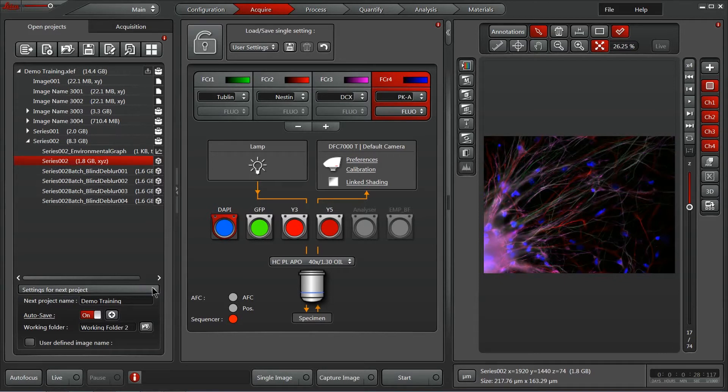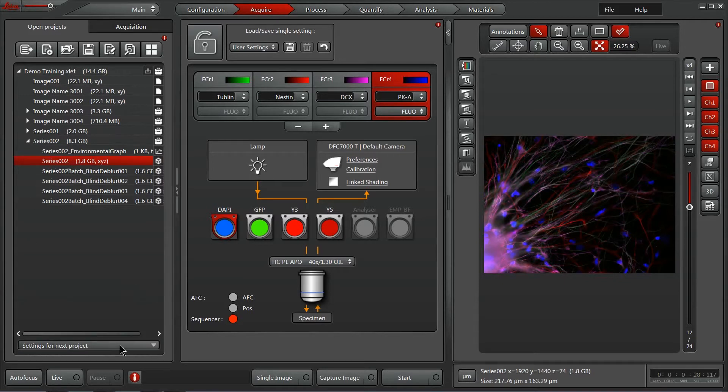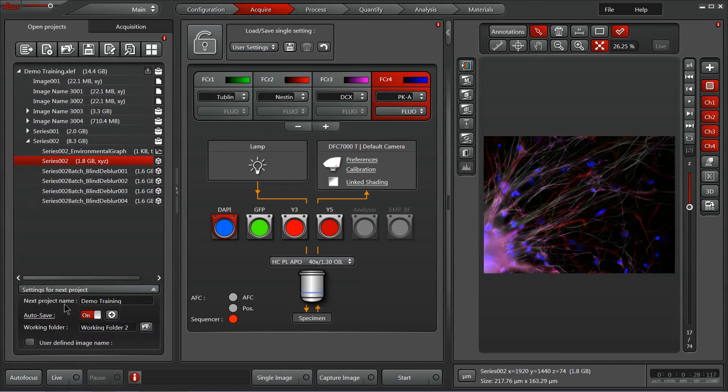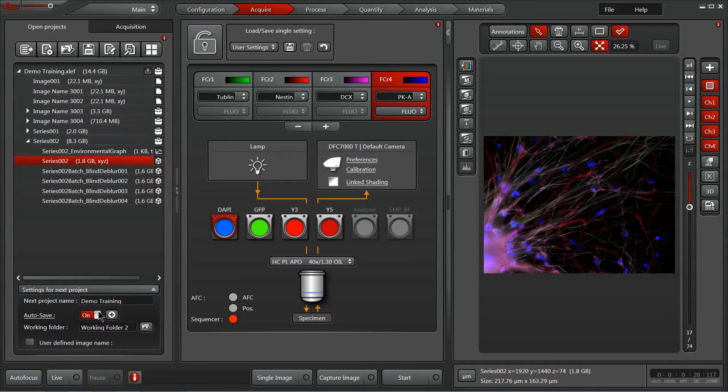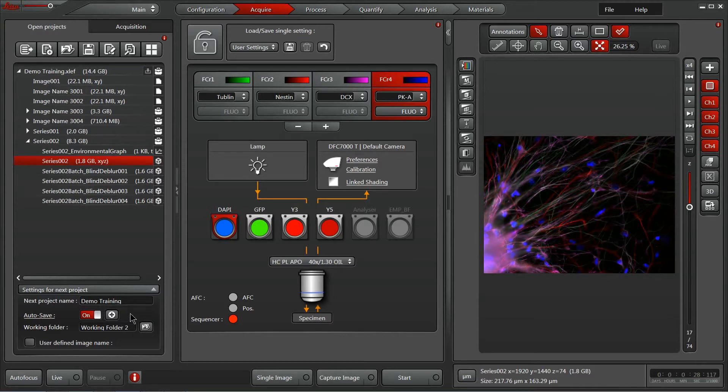Also, here on the bottom, we've got a settings for new projects tab within which you can actually activate an autosave feature. I like this because I like to have things automatically saved. If you hit this plus sign, you can also get access to the folder tree wherein all that autosave data is going to be saved for you.